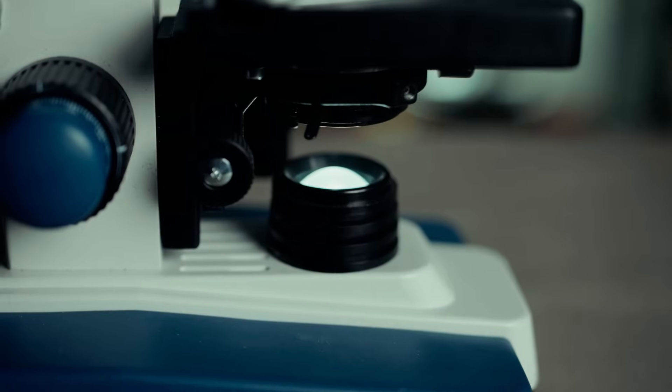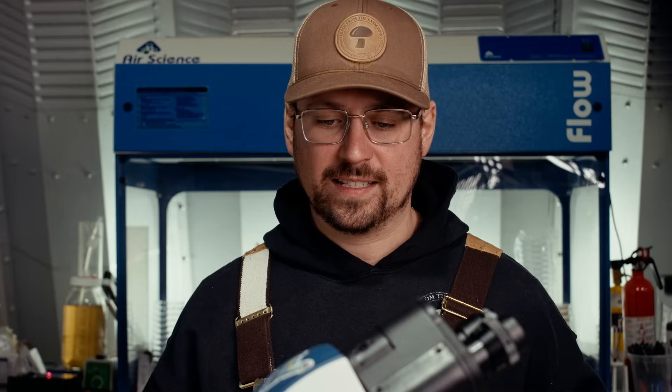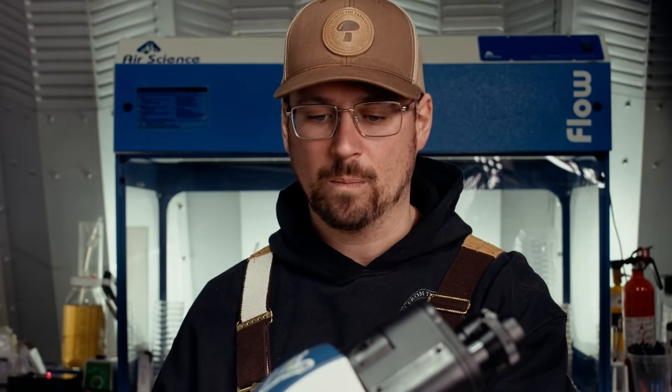When I'm looking at the Amscope, there's the light source attached to the base as well as the arm of the microscope. Today's modern microscopes have LED lights as the light source, compared to old antique scopes that used sunlight and mirrors. We're lucky to live in a modern age where microscopes of very high quality are relatively inexpensive. After the light source you're going to have the stage of the microscope, and this is where you place your slides.